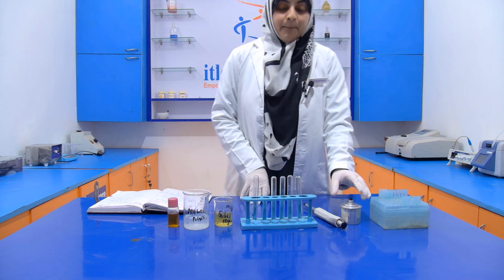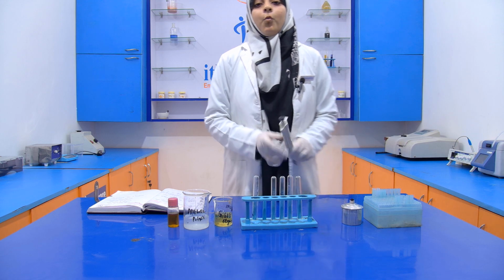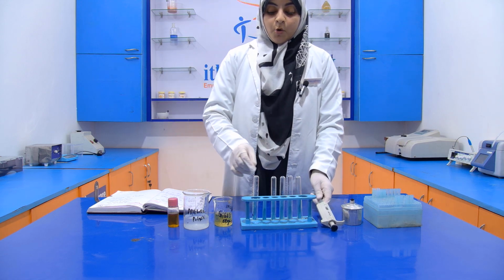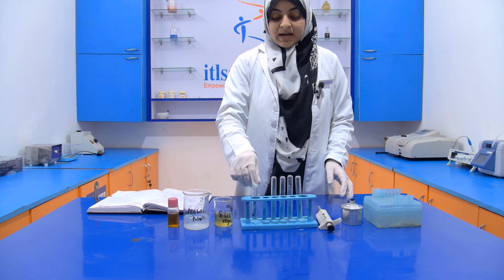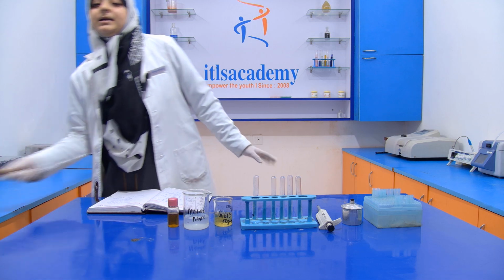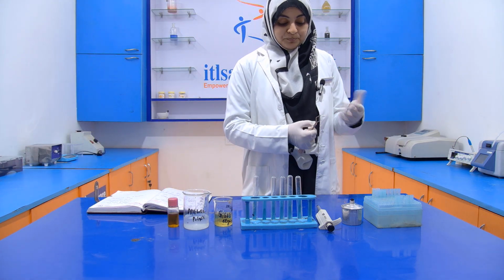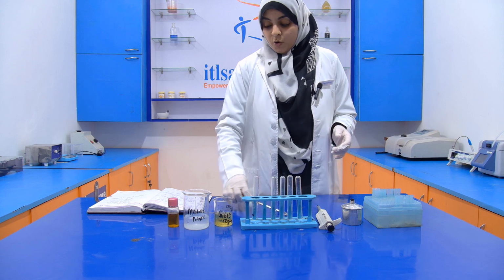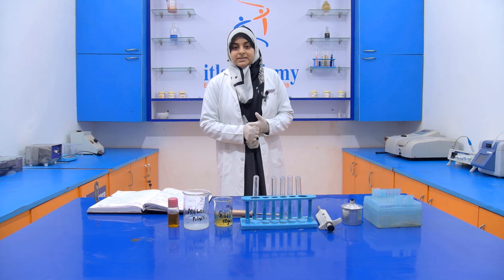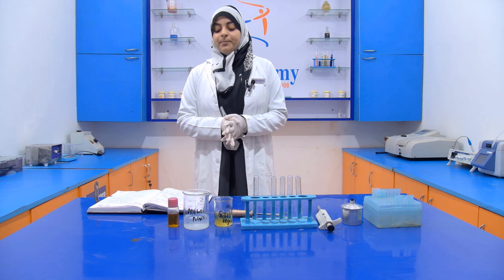Then we require a burner, a micropipette of 1000 microliter or 1 ml, a test tube stand, micropipette tip, and test tube holder. Okay, because when we heat, then we have to use this holder. Now what we have to do, we take 2 ml of the oil as a sample, into which we add 1 ml of this alcoholic potash.